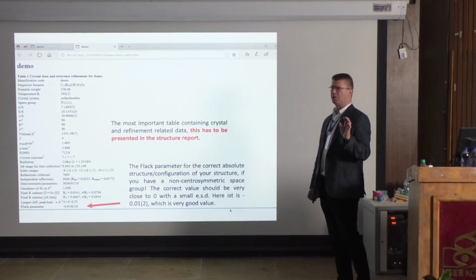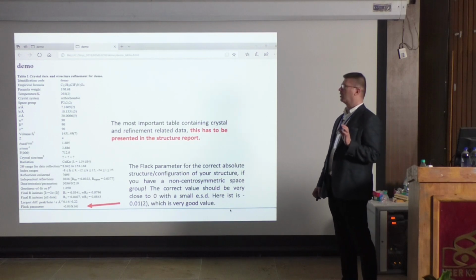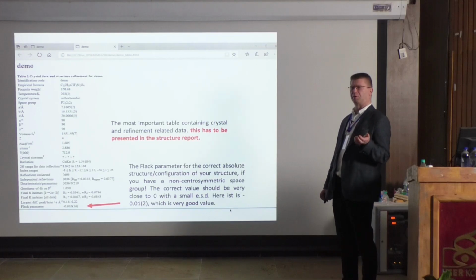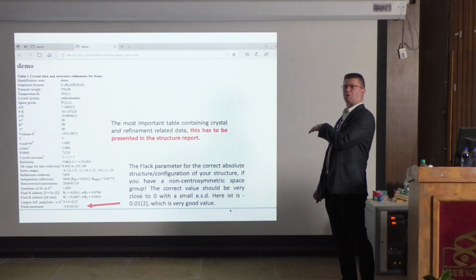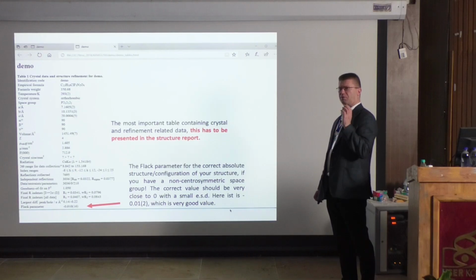But it disappeared some 10, 15 years ago when the CIF file came, you will soon see what a CIF file is, that's the crystallographic information file which the program provides. When this became available, then it said, okay, you can find this information either from the SI or from the database.